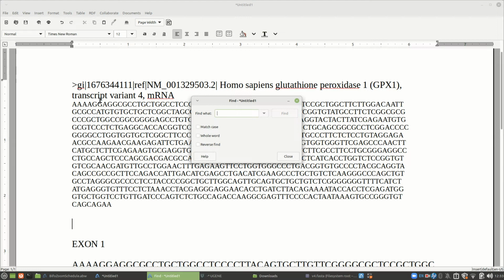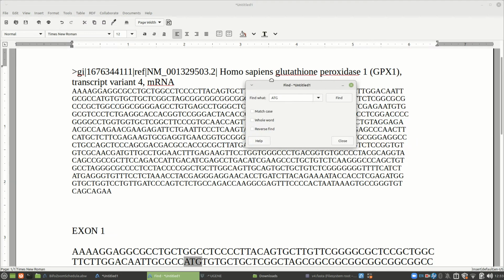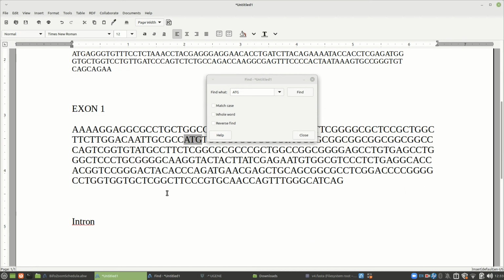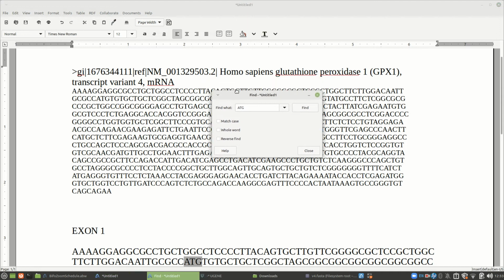We're looking for an AUG. So if we're looking for an AUG, here we're going to have to use T's, so it's ATG. Now we're in RNA, so this is fine. You don't have to translate it or reverse translate it. So ATG. Let's find all the ATGs. All right, did it find any? Well, it did down here, which is great. What about up here? Where's our ATG up here?